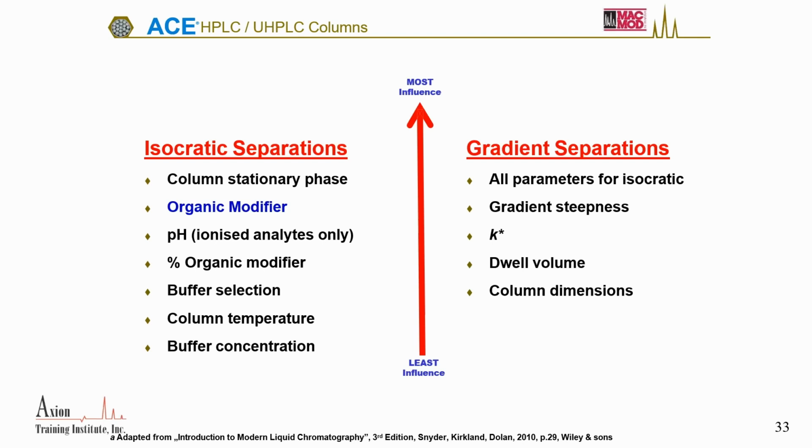So let's take a look at different mobile phases. Everything we've run so far has been methanol. I start with methanol, then I move to acetonitrile if methanol doesn't work. Why? Methanol's a lot cheaper. I just bought it, $100 a case at VWR. So thank you, VWR. It's a high-grade methanol. Acetonitrile is about $600 and up a case. So I start with methanol, and if it doesn't work, I try acetonitrile.